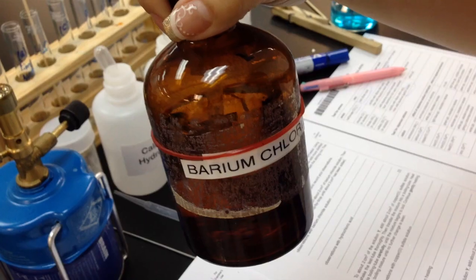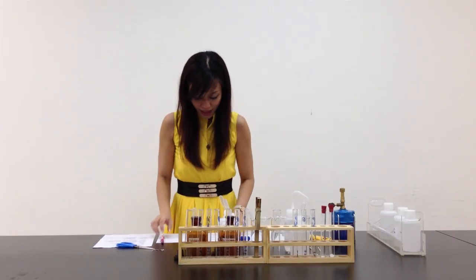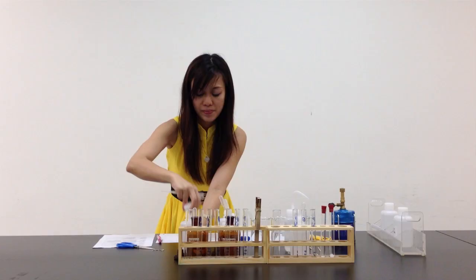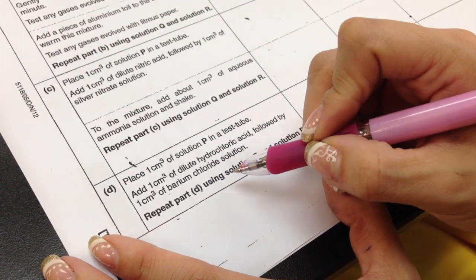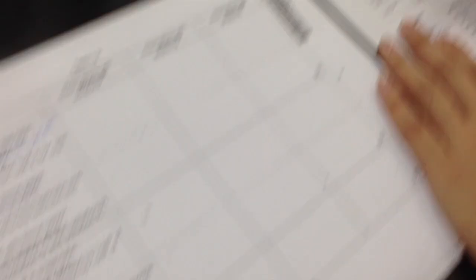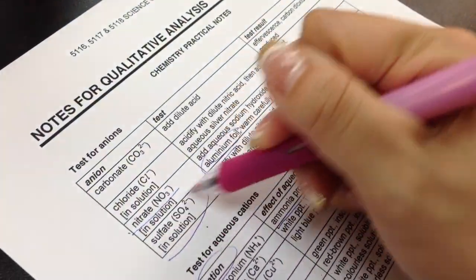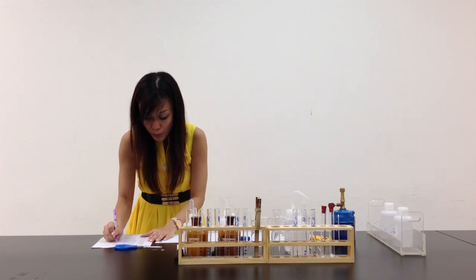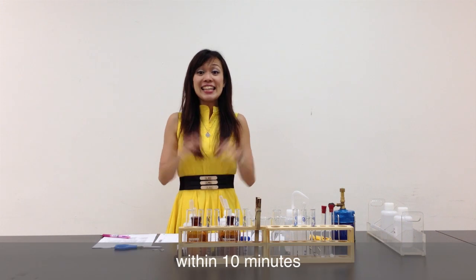Let me prepare my solutions — barium chloride is here, and hydrochloric acid is right here. Now, barium chloride is from the QA notes. In the QA notes it says barium nitrate — when using barium chloride or barium nitrate, they are testing for the same thing: sulfate. If there's a white precipitate, there is sulfate present. I've finished my preparation in 10 minutes.